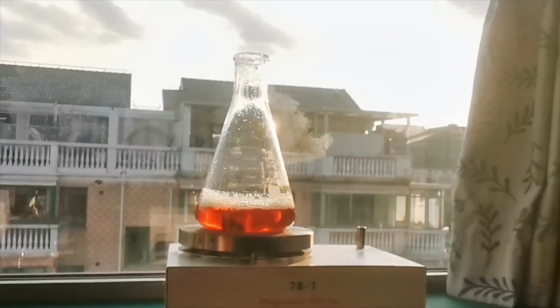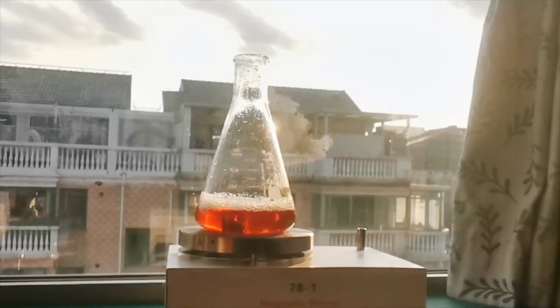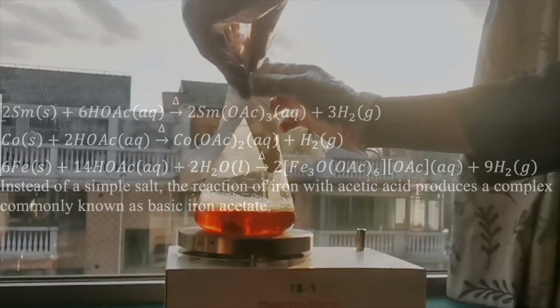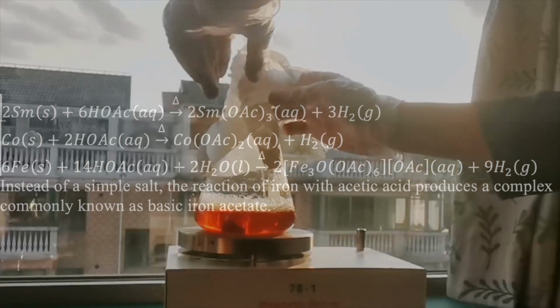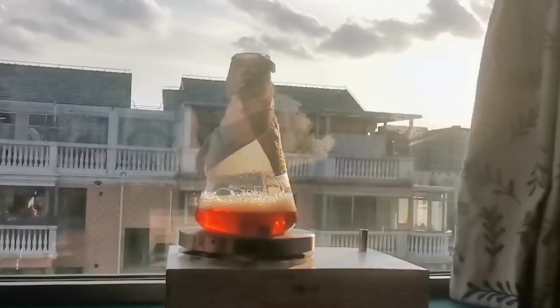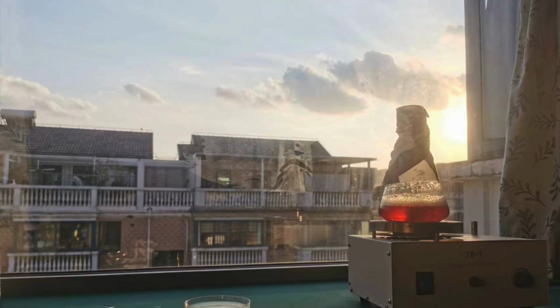As the acid gets closer to boiling, there was finally a visible reaction occurring. The magnet is releasing some bubbles, and the acid turns to a deeper orange-red color. The samarium and cobalt, as well as iron impurities in the magnet, are reacting with acetic acid to form the metal acetate and hydrogen gas. Over time, the acid slowly darkens in color, and the setting sun made its color much more beautiful. The camera certainly didn't do the reaction justice. The bright orange sunlight and the cherry red solution really made my day.